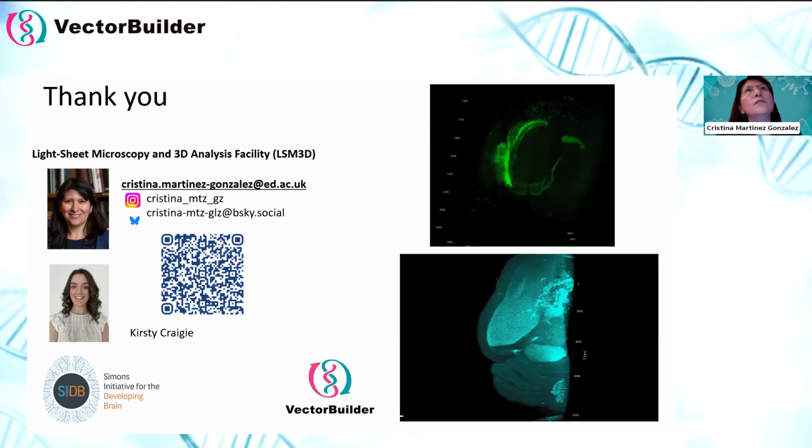And I would say finally the timings. I think sometimes people don't clear long enough. For the solvents, the protocols are 1 hour or two per solution. But if the tissue is bigger, just wait or exchange the solution and add more. Don't be afraid to modify the protocol to extend or reduce the incubation times, depending, to allow enough clearing.